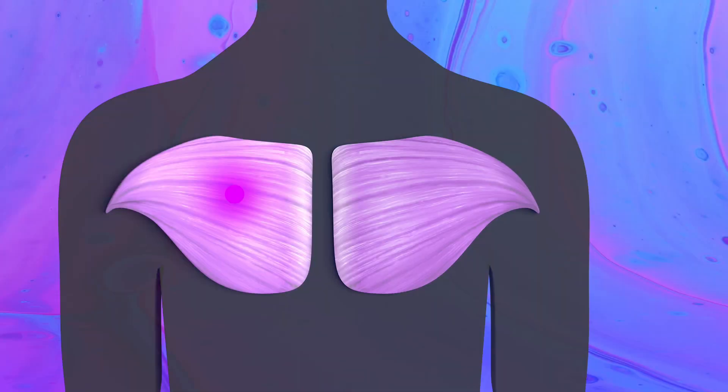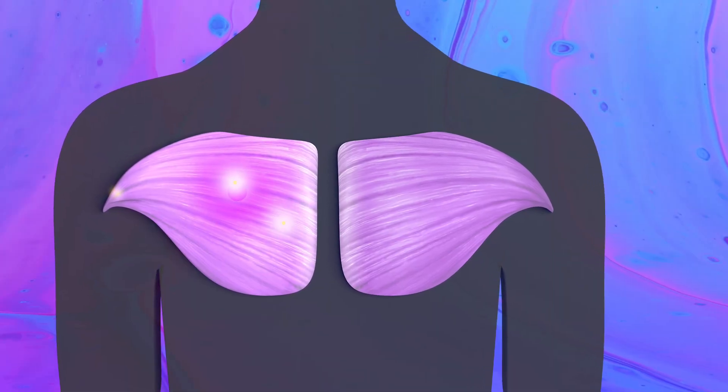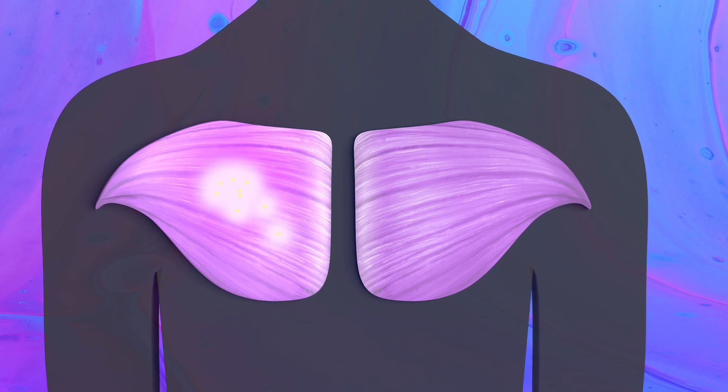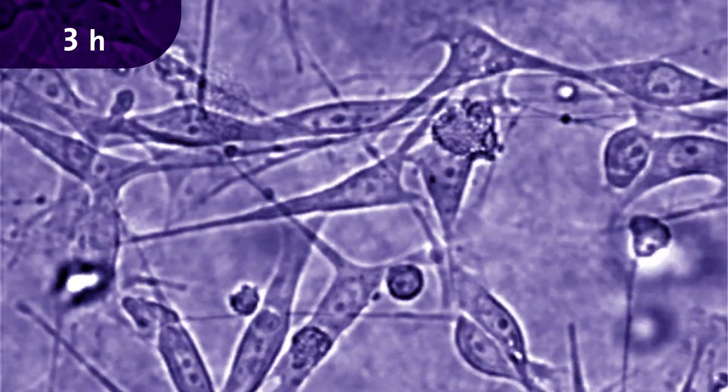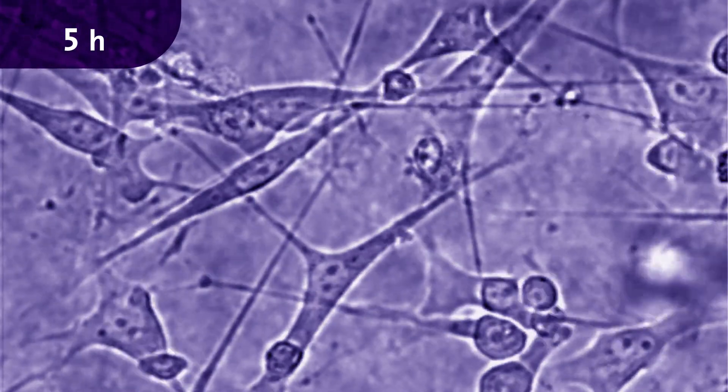The immunological tumor defense is particularly successful when T cells cooperate at high cell density. This is known as an immunologically hot tumor. Here, a swarm of T cells is busy with a network of tumor cells in tissue culture.